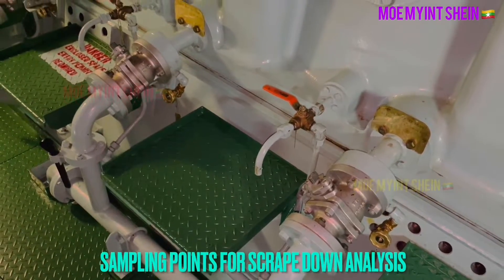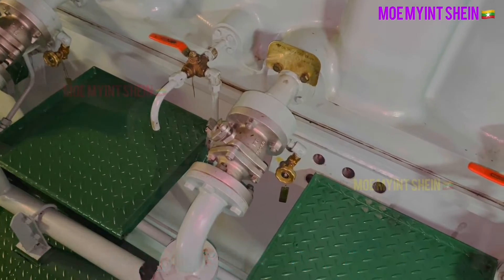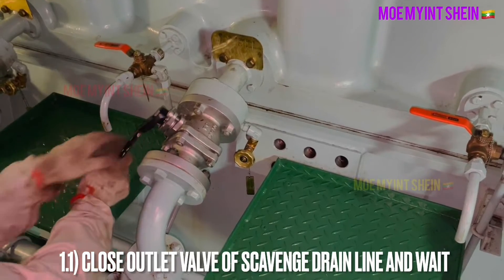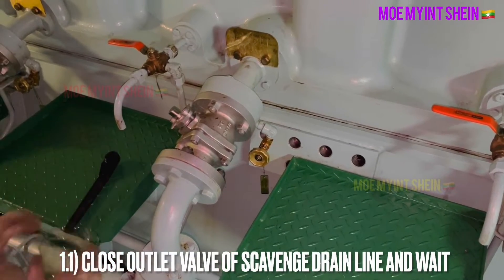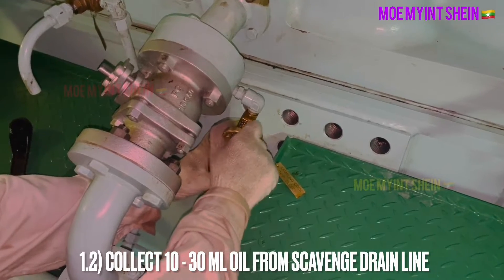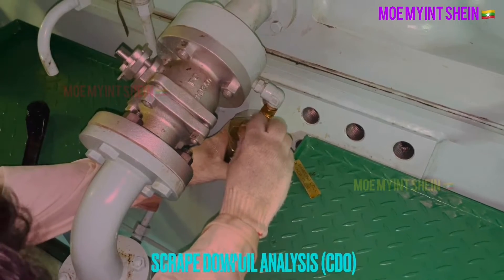These are sampling points to collect used cylinder oil from under piston space. First, close the outlet valve of the scavenged drain line and wait for a while. Then collect 10 to 30 milliliters of used cylinder oil by opening the sampling valve.